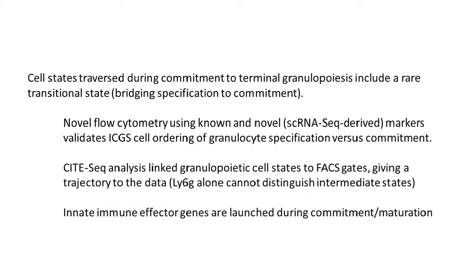So by revisiting terminal granulopoiesis, we've identified a new rare transitional state that bridges the specification and commitment stages. To do this, we utilized novel flow cytometry and CITE-Seq analysis to give a trajectory to our transcriptional data. And this highlighted that our neutrophil effector genes are being launched during the commitment and maturation process.